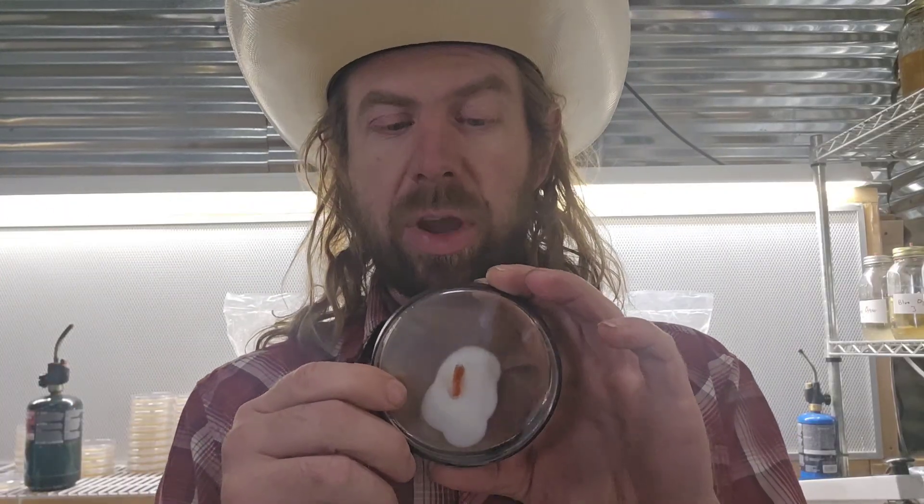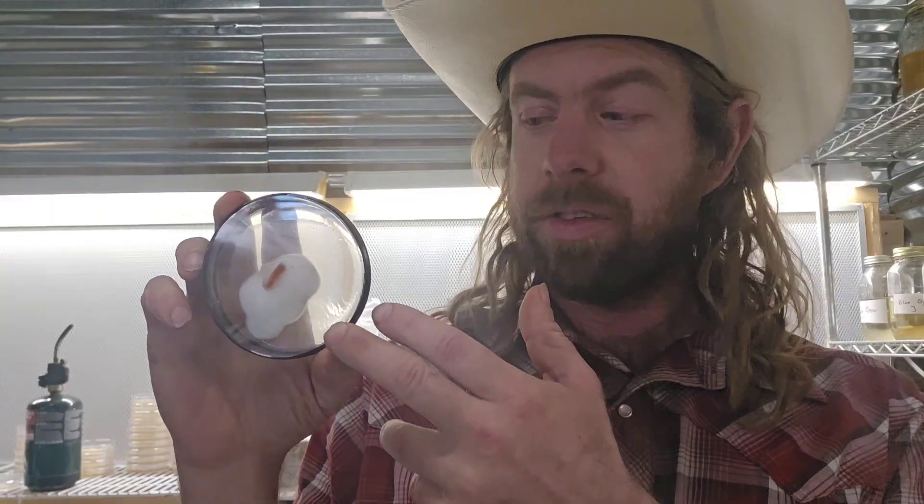What I'm going to do here: I'll take sections of this culture and put some into slants to preserve them, put some straight into liquid culture, and put some onto more agar to expand it. I'm also going to expose some to light just to see if they turn orange — they should turn orange. However, the liquid culture and slants I'll keep in total darkness. Cordyceps is highly photosensitive — exposing it to light initiates fruiting, so you want to keep these in darkness until it's time to fruit.